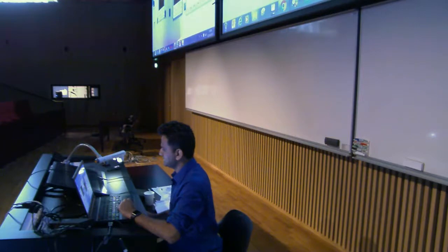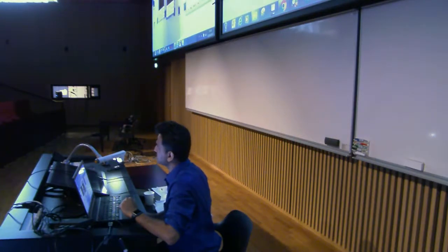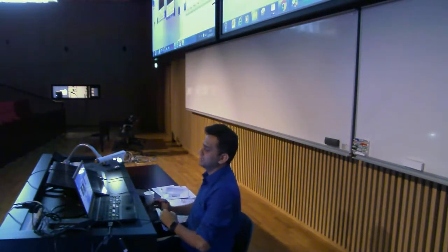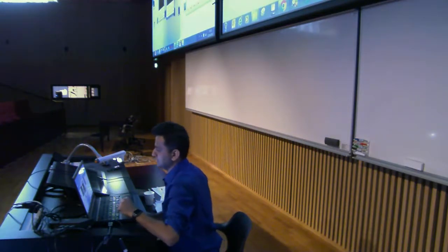So this is the mean intensity of that particular region for channel number 1. Because this slide is at the red channel, this is only showing the red channel. Now if you put this here, this is for the green channel for this particular region of interest, right? So maybe this is interesting if you just want to see the degradation or the FRAP kind of analysis, what is happening. Can you show again what it was, this option?